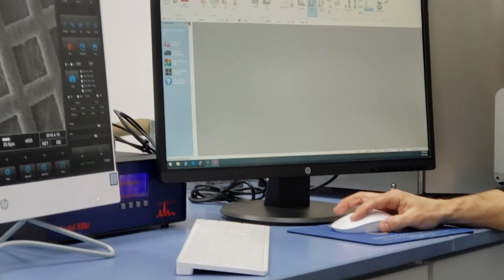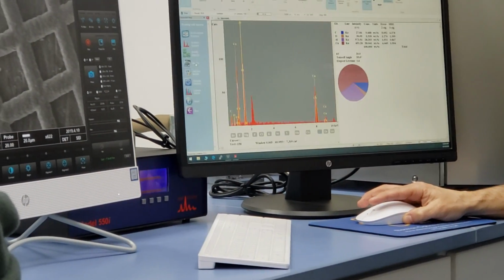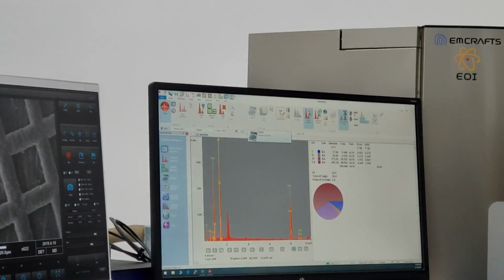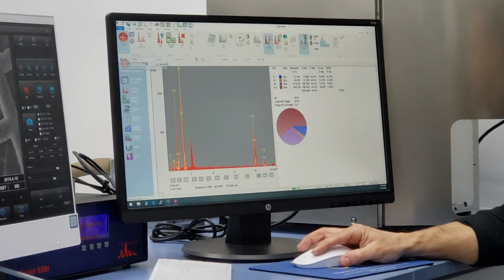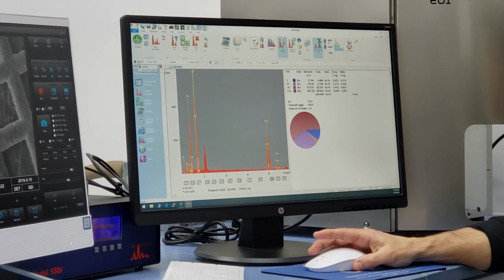How do you do that again? So if we use the flowchart system, all I would need to do is just hit analyze. I skipped and I hit the calculator up here. We haven't gone over that yet. But there's a lot of ways to skin a cat in this software. I'm just about to hit those ways.